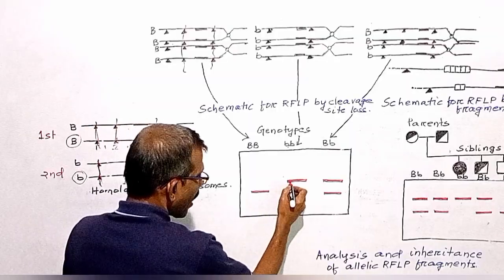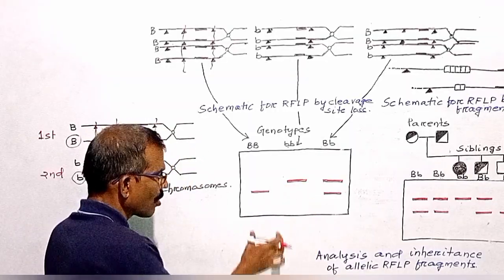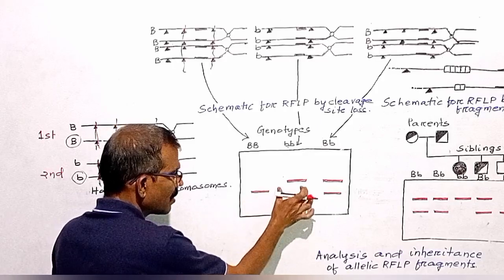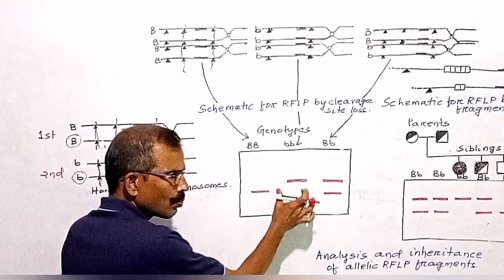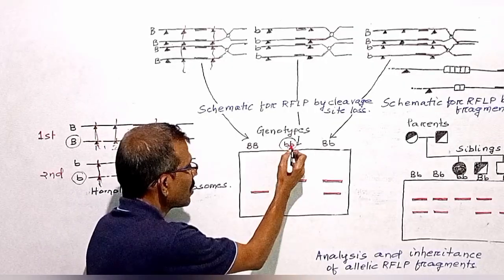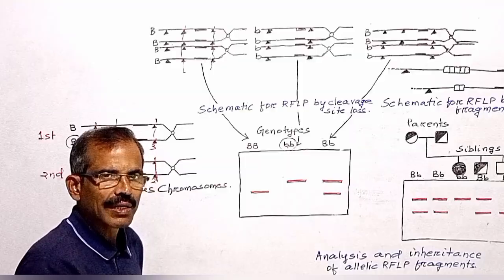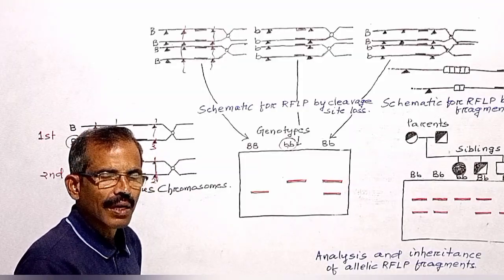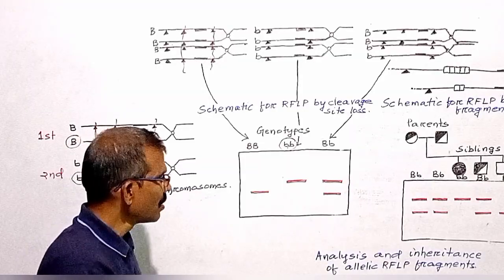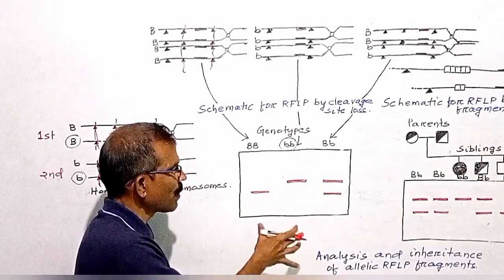But the DNA fragments present in this band will be larger than the fragment of that band. As a result, these fragments will move slowly through the gel. Because both alleles are the same, the DNA fragments will migrate as a single band. After hybridization, the single band can be detected on the nitrocellulose paper.